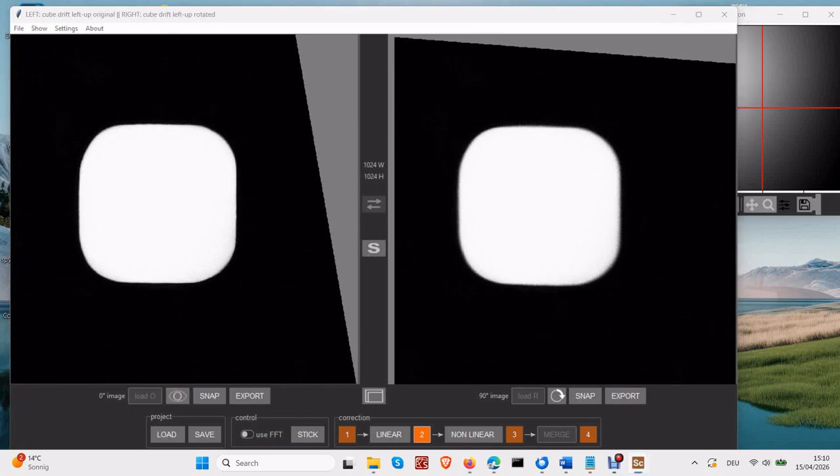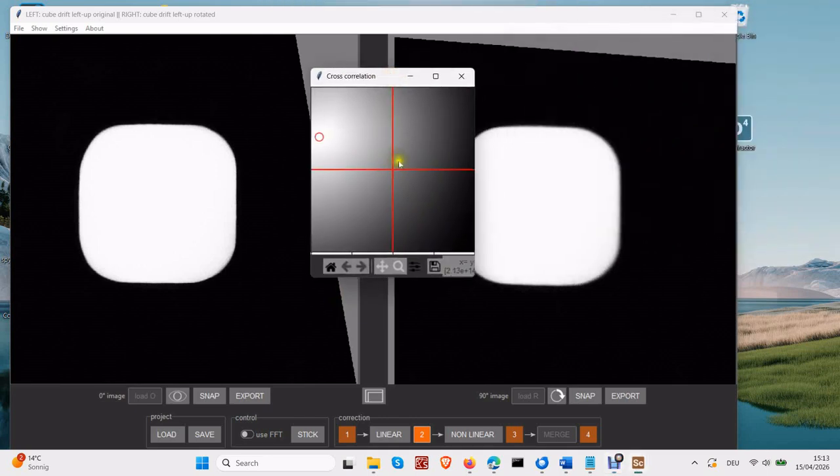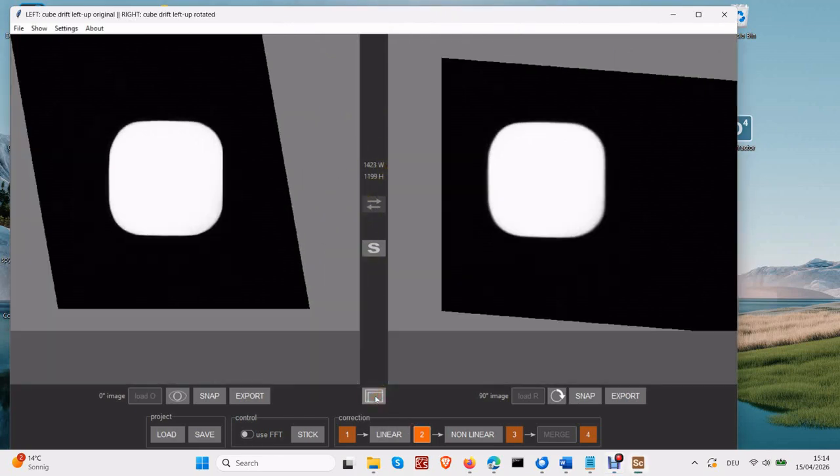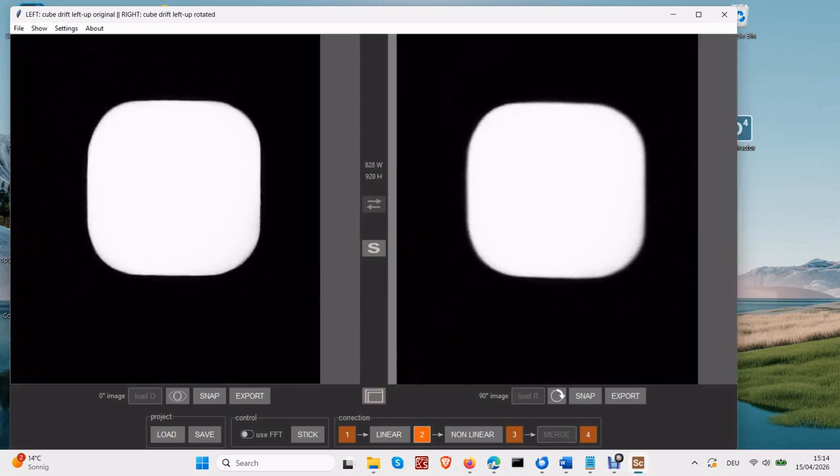How was this done? Well, rather evident assumptions. Cross-correlation detects the shift between the two images and corrects both, assuming a continuous constant drift. Notice that the edges of the images are now inclined due to deformation. The images are still displayed at their original size. If you want to see the full corrected area, click the Frame button. Clicking it again toggles to a minimal frame where empty areas are hidden.